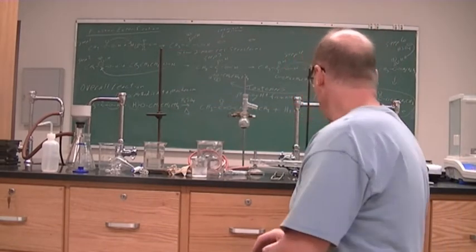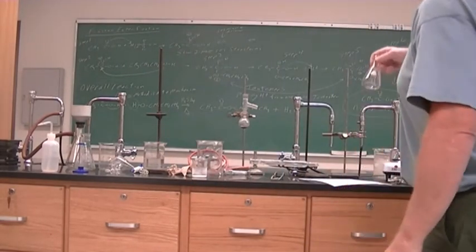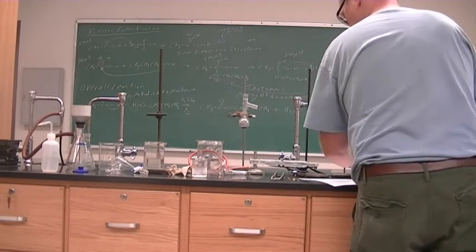Alright, so we'll let that do its thing for a while. I'll set up the distillation with our weighed flask here. And here, we set this all up.